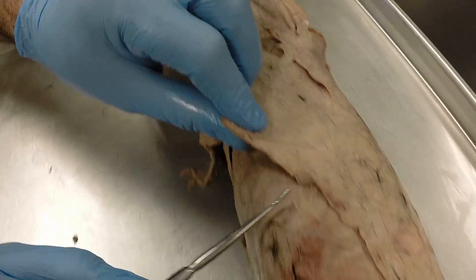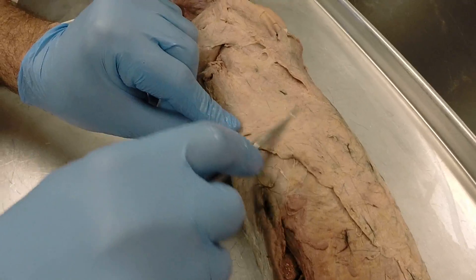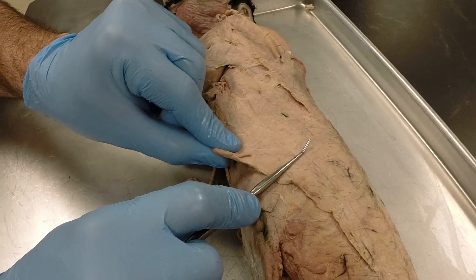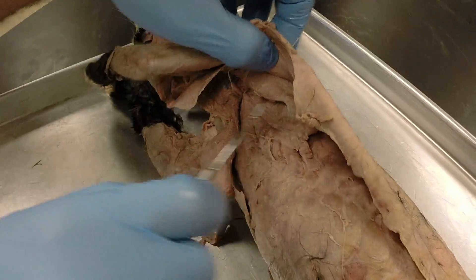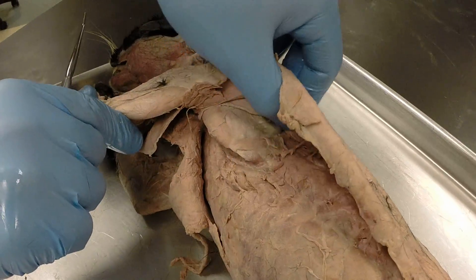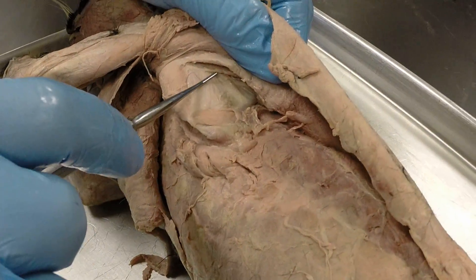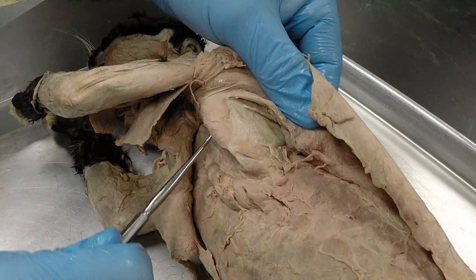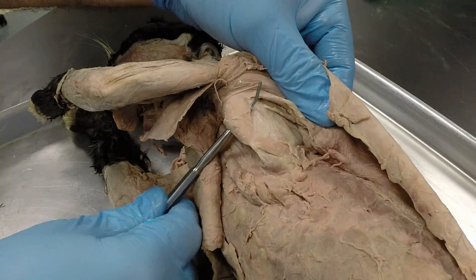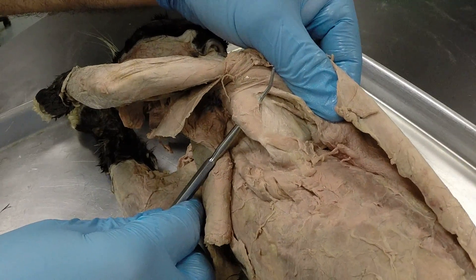Moving out to the flank, we have this large sheet-like muscle — the latissimus dorsi. If I flip that up, it reveals the bottom half of the shoulder blade. You can see the infraspinatus muscle there. And then you can see the teres major muscle on the inferior side of the shoulder blade.